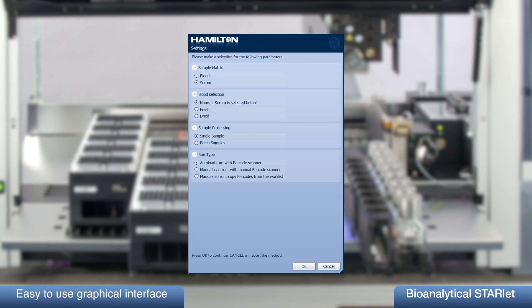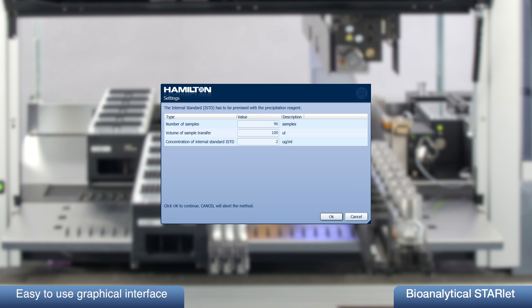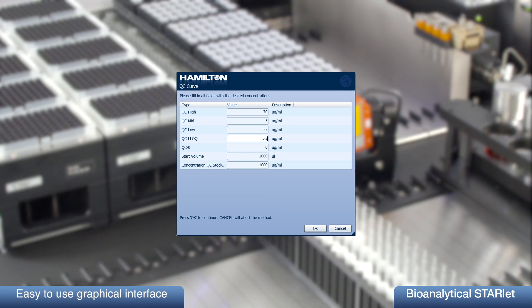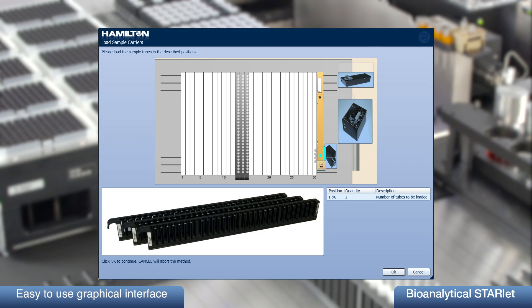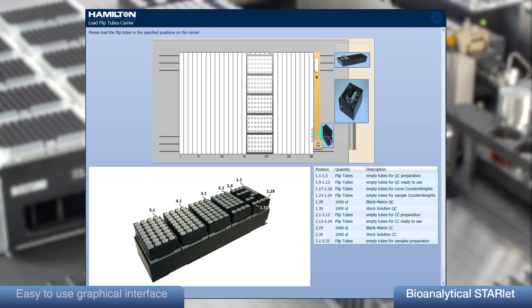An easy-to-use graphical user interface guides the user through the start of the system. It allows the reduction of the samples, the number of calibration points including the concentrations, QC points and concentration, and determines the respective reagent volumes required. In addition, it supports the loading of samples, controls, calibrators, and reagents.